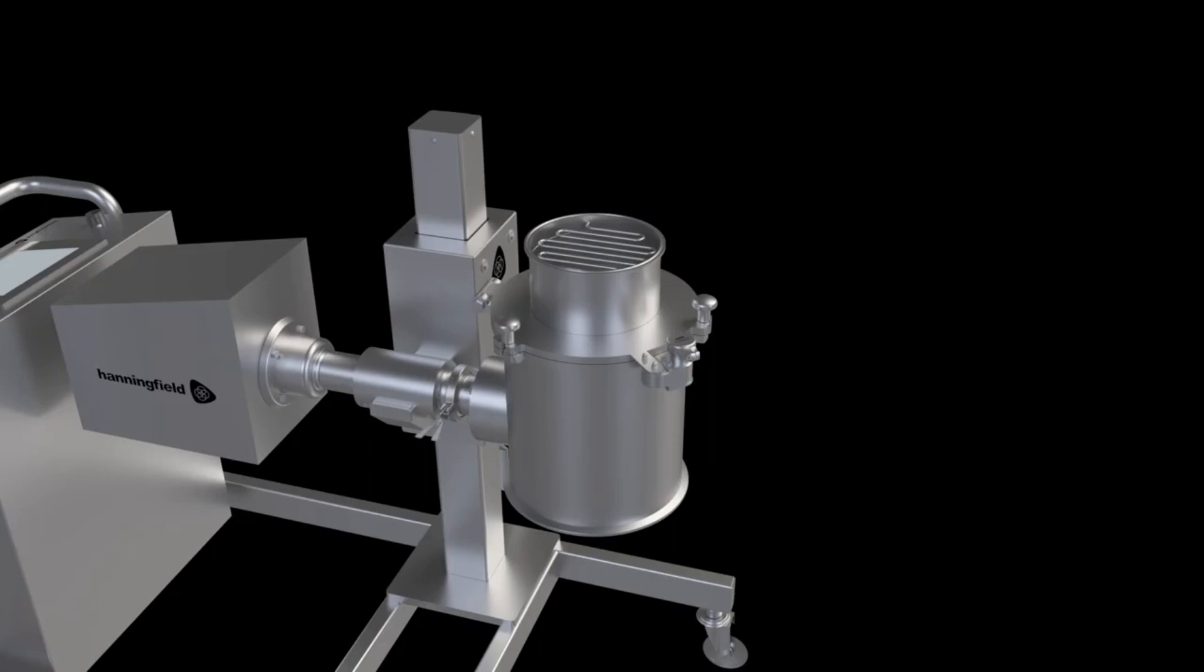For simple cleaning, the entire machine housing can be detached for autoclave by undoing a single tri-clamp.